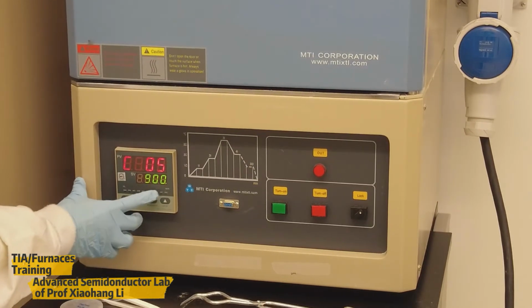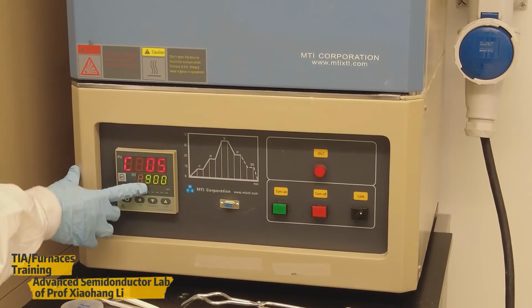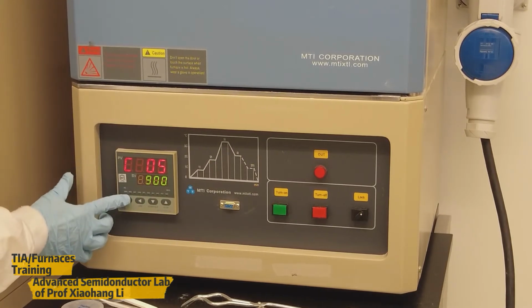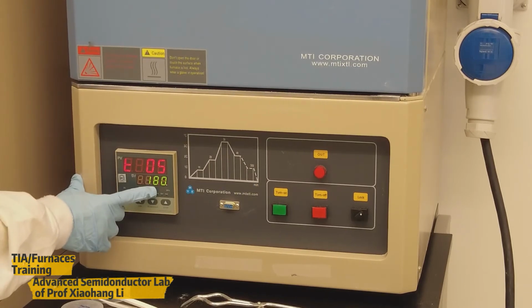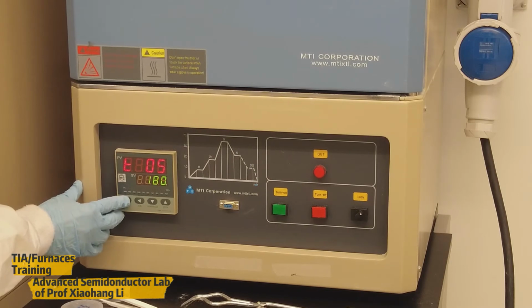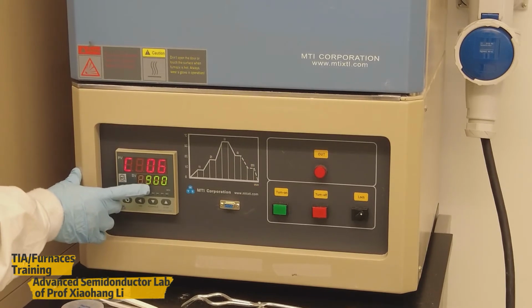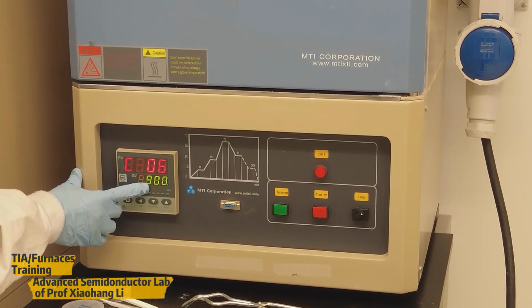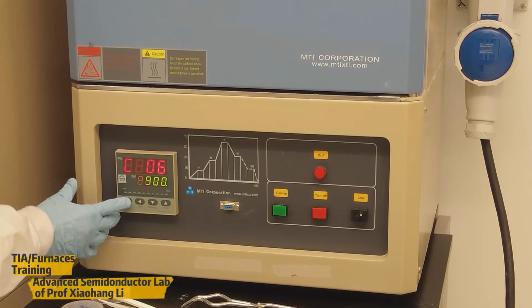Okay. Right now, we will maintain this high temperature for 3 hours. So the next time interval will be 180 minutes. Then the next temperature point is still 900. Okay. So the next one we will ramp down the temperature.